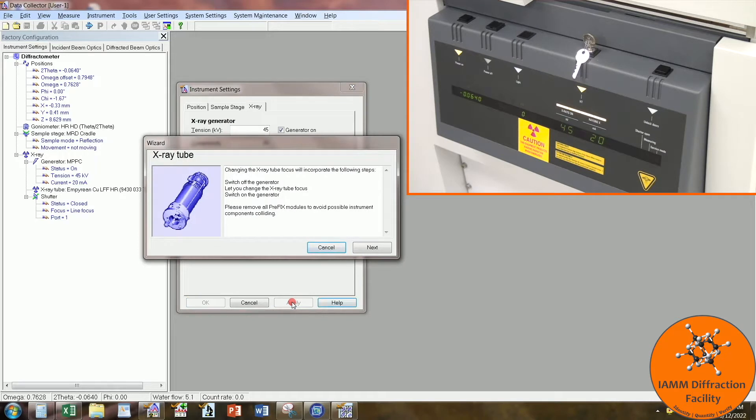This says please remove all prefix modules but nothing inside really moves for this process so I will ignore this and just click next. You should then see the voltage and amperage decrease and eventually they will go to zero.